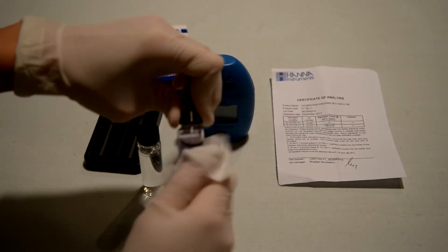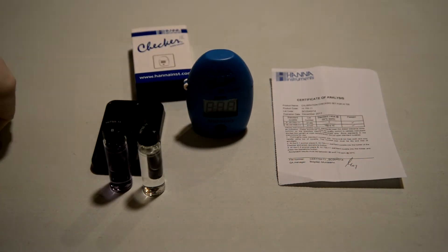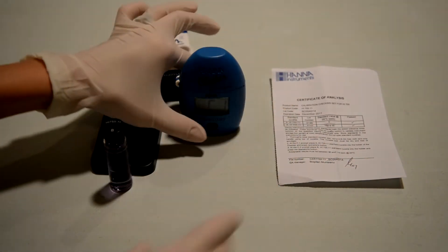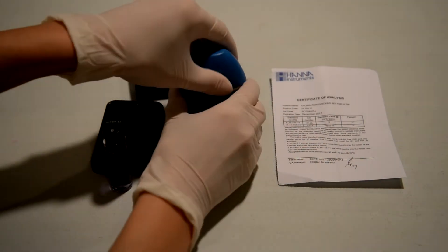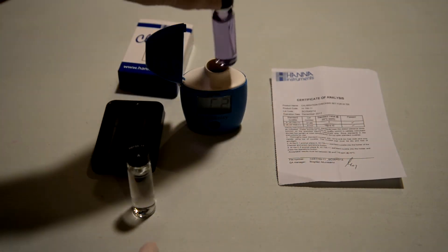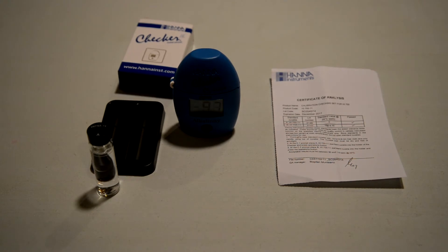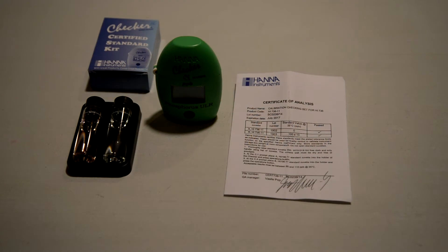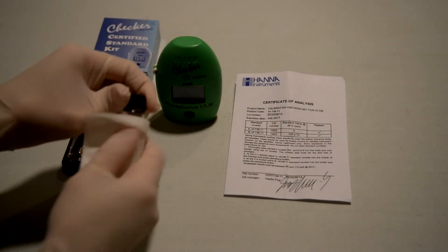The bad part about doing this is when you go to somebody's house and you run these test kits on a checker, if it's not within range, there's not a lot you can do. You basically have to contact HANA, give them the checker back, and tell them to fix it. That's definitely a bummer — we have walked into a checker or two that isn't within spec and had to get a replacement.